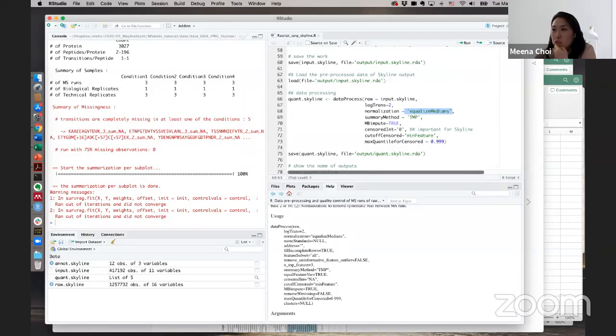For a larger data set in MSstats, we have several contributors who helped with some clustering, and we tested several different cases. Actually, in some cases this clustering doesn't work at all. So we currently stop using it just in case, but I believe for the next version we will have a better option for these cases.